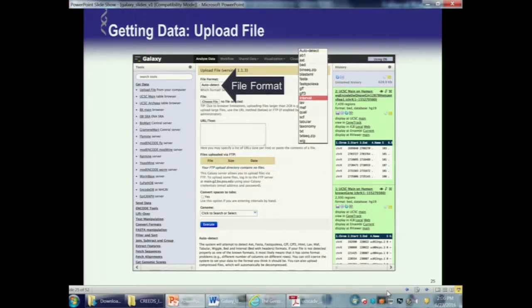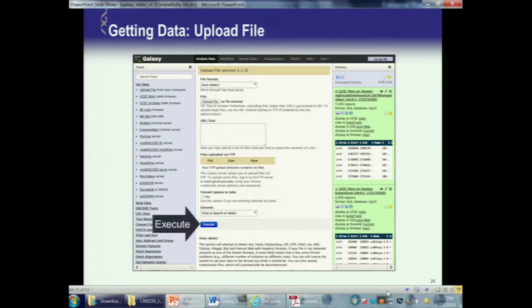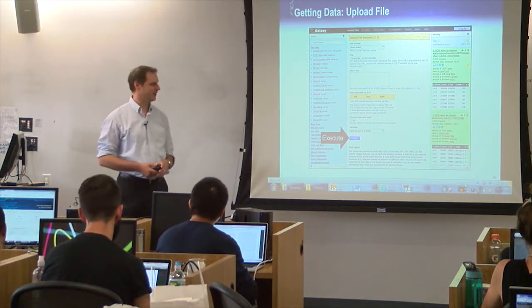It's smart enough to recognize a BED format file, or some other file format. It can take many different formats, like WIG format, GFF format, FASTA format, BED format, etc. One thing, I'm surprised it's not on this slide: you will always have to tell it what genome you're uploading. So if you have your own data and it's the mouse mm10 assembly, you have to select that.